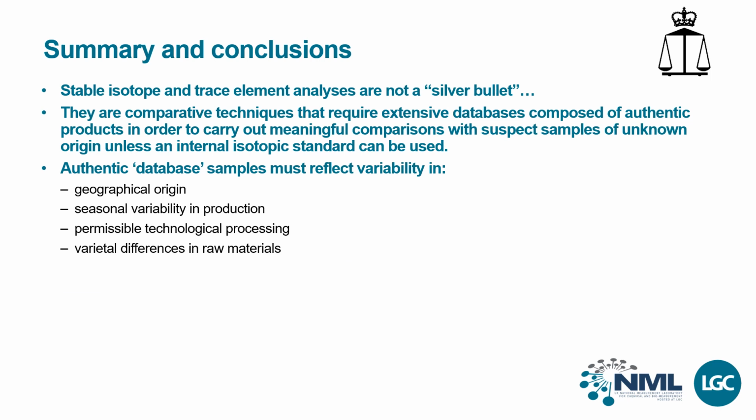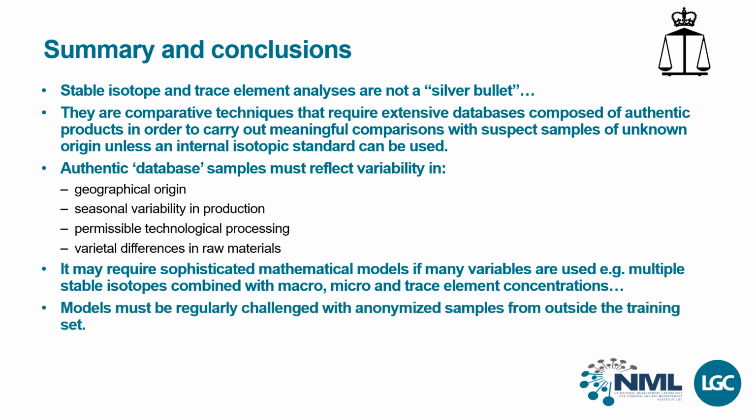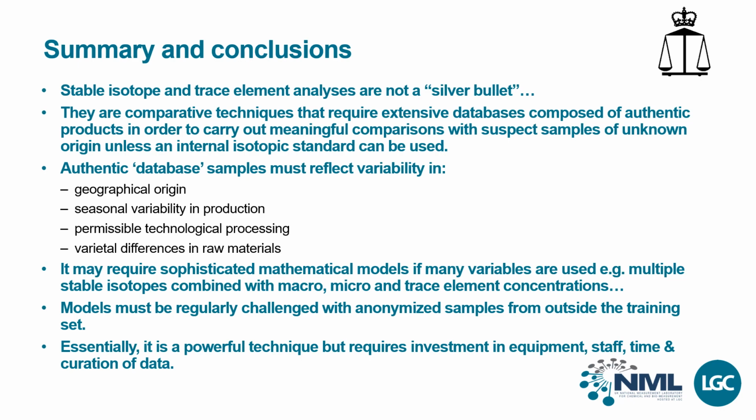Consequently, it may require sophisticated mathematical models to deal with that data and build reliable prediction tools for fraud interpretation. These models must be regularly challenged with anonymized samples from outside the training set.